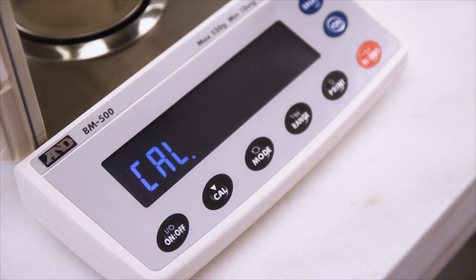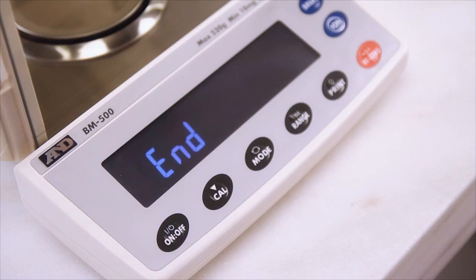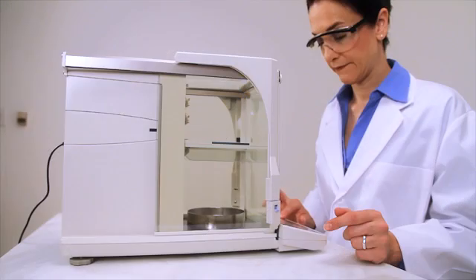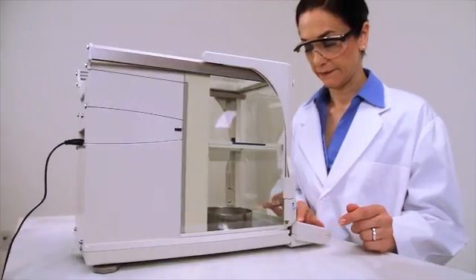Internal calibration is built-in and always available with a single key press. Or, let the balance automatically self-calibrate in response to changes in the environment.